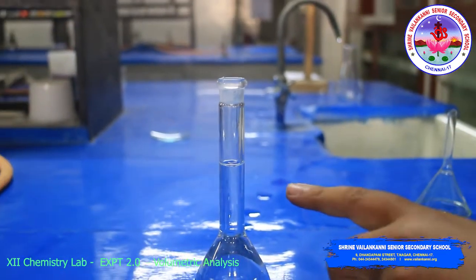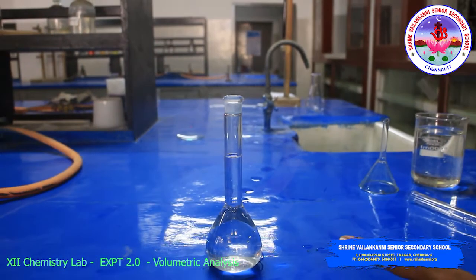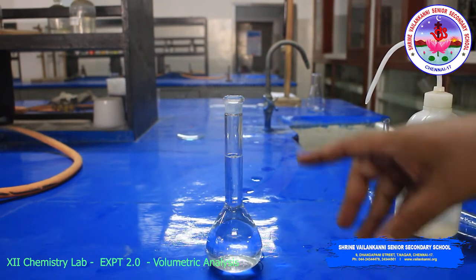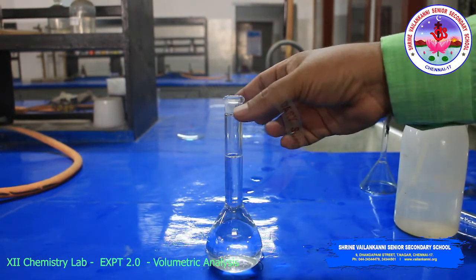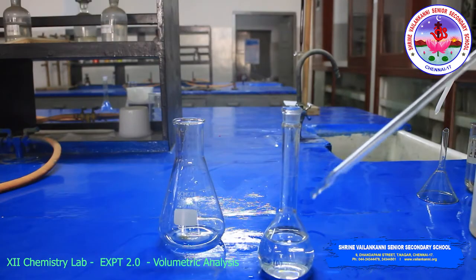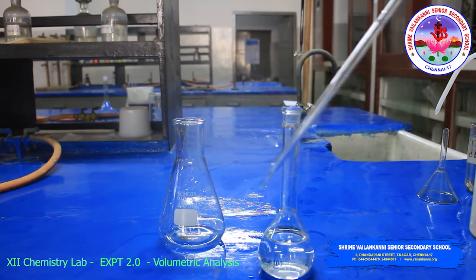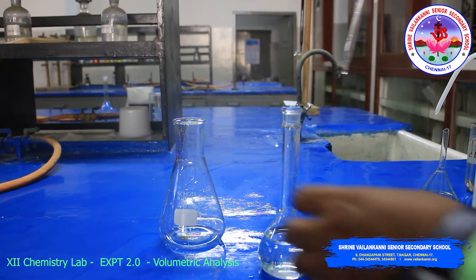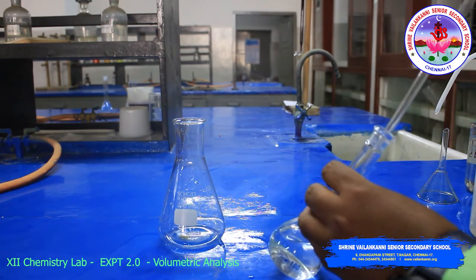Now exactly 100 ml. So this is M by 50 solution of oxalic acid, 100 ml standard solution. Now we can titrate against the KMnO4 in this solution. Rinse the pipette with the solution of oxalic acid. After rinse, you have to take 20 ml of the standard solution in the pipette.